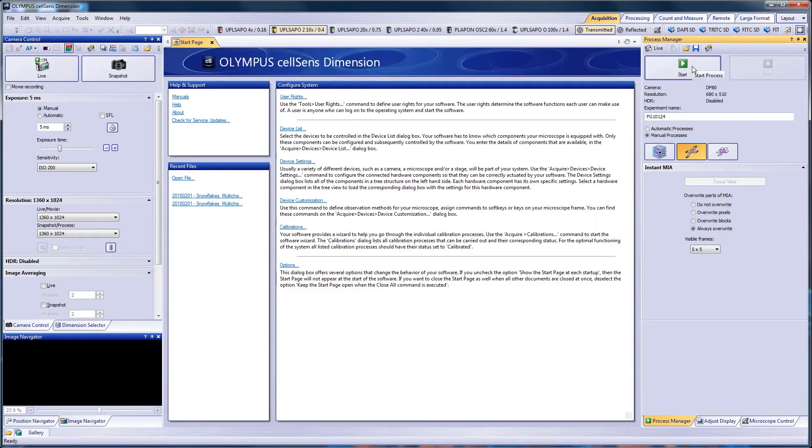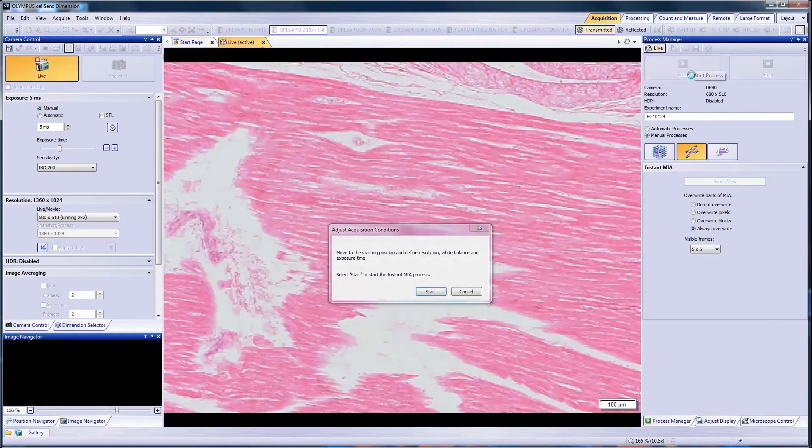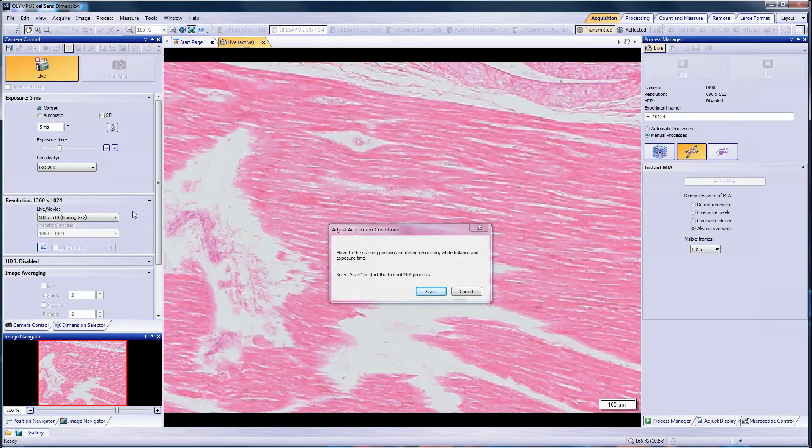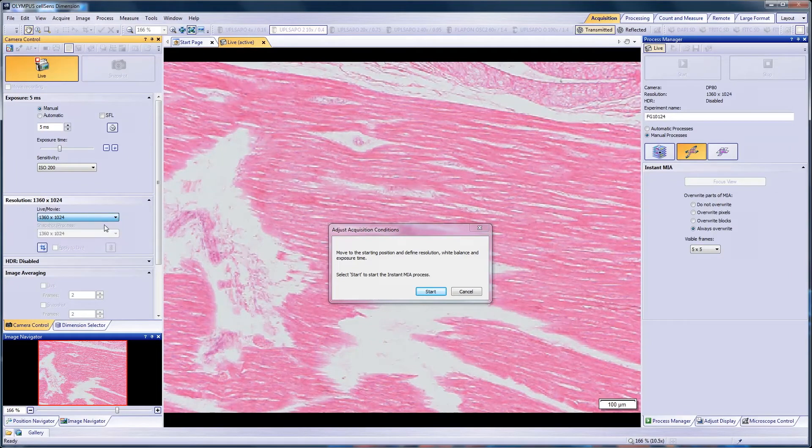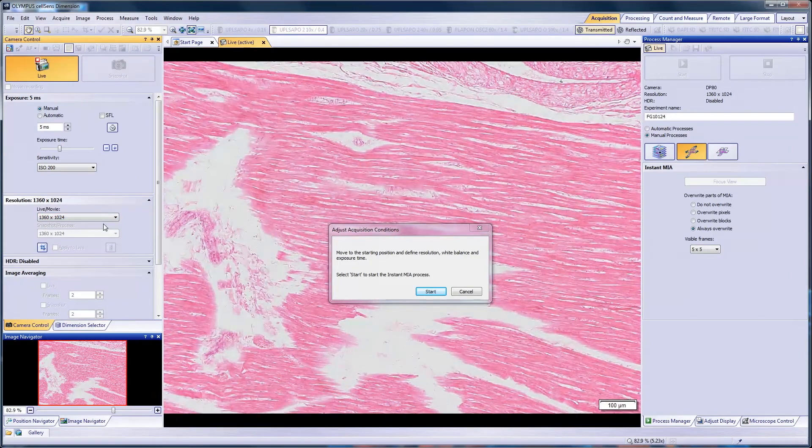Once you have defined your settings, press Start. The software will have you confirm your focus and acquisition settings.